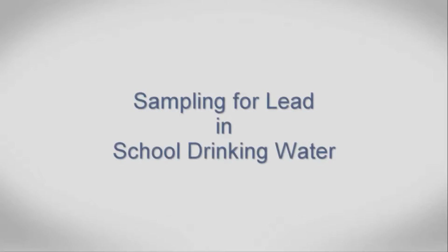Sampling for lead in school drinking water. This video was created by the New York State Department of Health and adapted for use in Massachusetts.